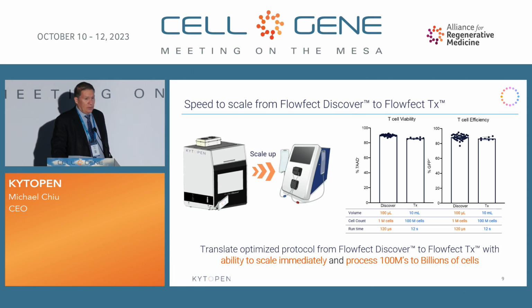If you need to get to higher volume post-clinic, it's a fairly straightforward path to doing that. And we've demonstrated volumes over a liter. I think you could easily get to 5, and you could run systems in parallel to get to higher volumes.